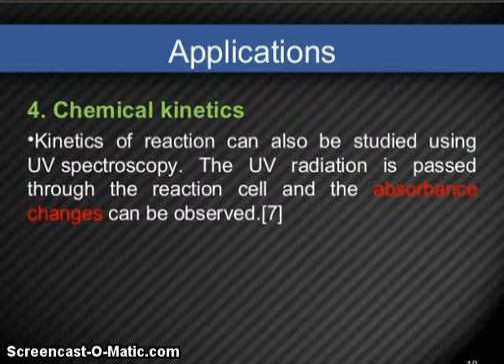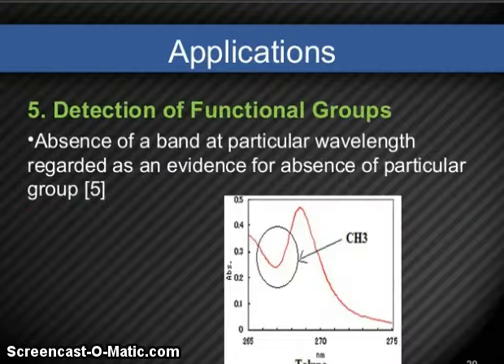So chemical kinetics. Kinetics of reactions can also be studied using UV visible spectroscopy. The UV radiation is passed through the reaction cell and absorbance changes can be observed.